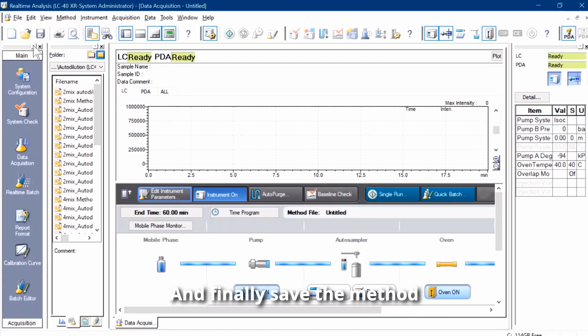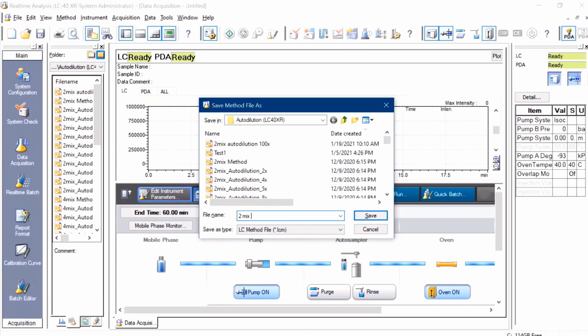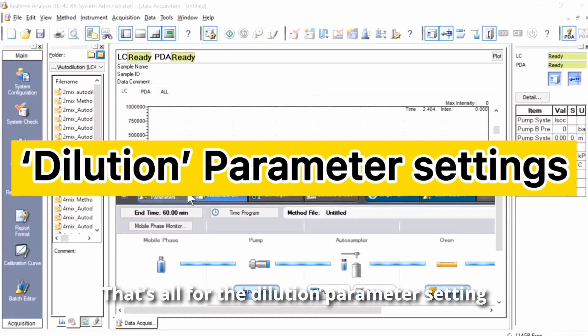Finally, save the method. Key in the method file name, then click Save. That's all for the dilution parameter setting.